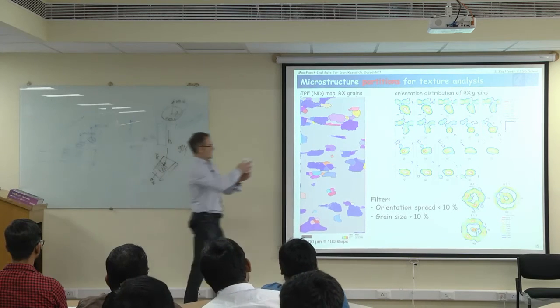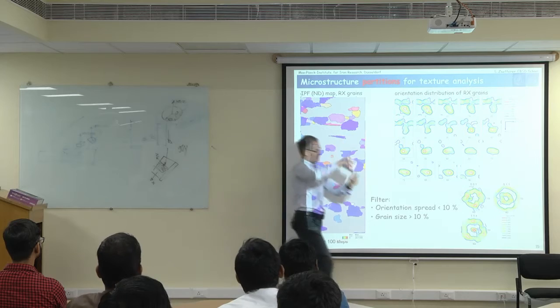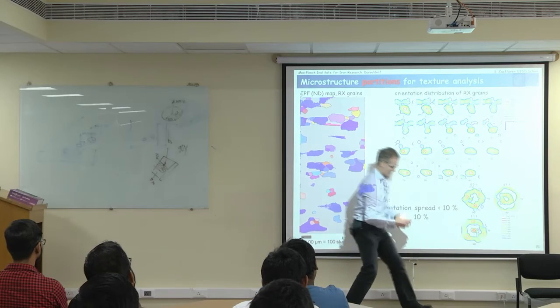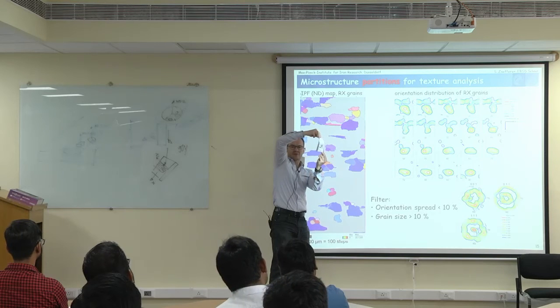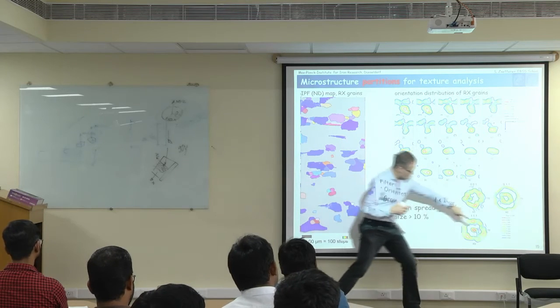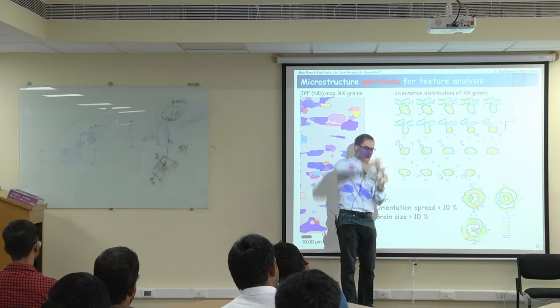So the grains are actually standing with the 1 1 1 in the normal direction, and they just rotate around that. So that makes this homogeneous ring. It's not fully homogeneous. We see that it has 3 maxima. That means obviously there is a particular rotation of these 1 1 1 grains with the 3 maxima, which is also preferred. It's not simply a completely homogeneous rotation, but there seems to be one set of these rotations a bit more preferred than the others.